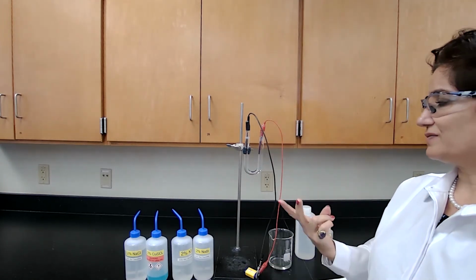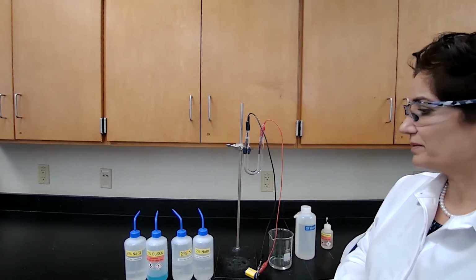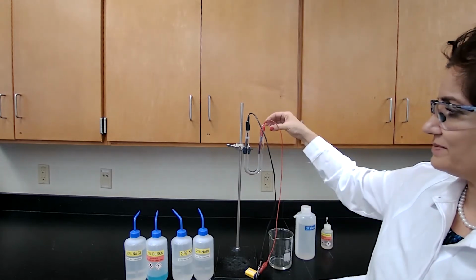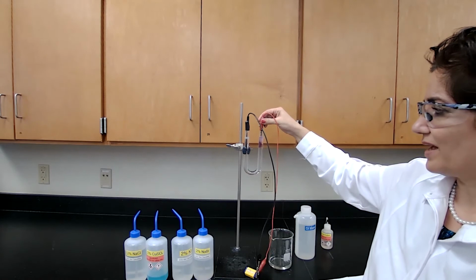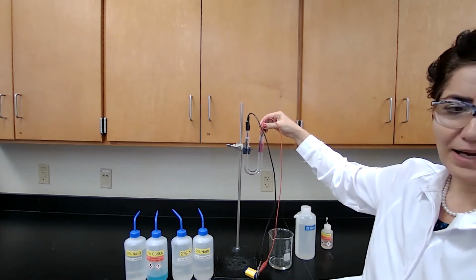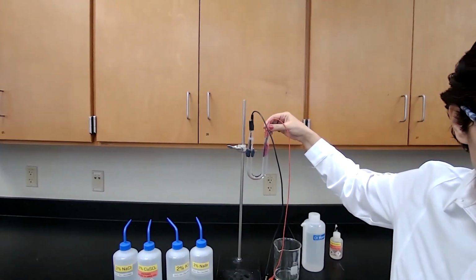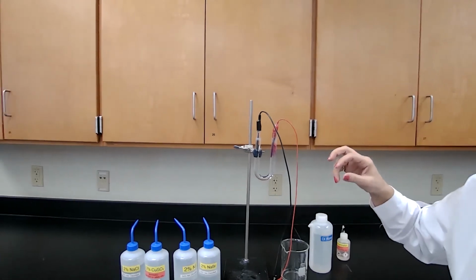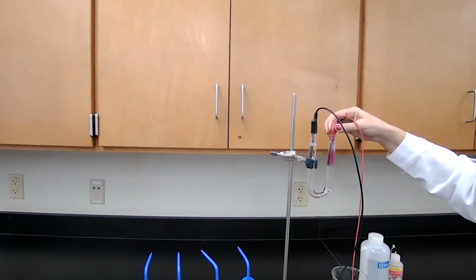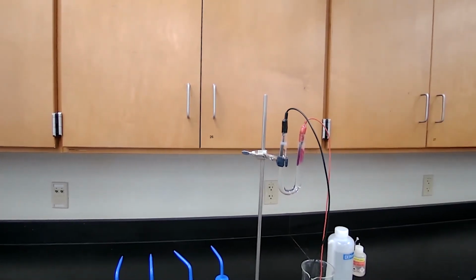So the two choices we have are either sodium being reduced or water being reduced. Water reduction is much easier to see. It's already changing to pink color, which is kind of obvious, and I can bring this slightly closer. So water is being reduced, and sodium is not being reduced.